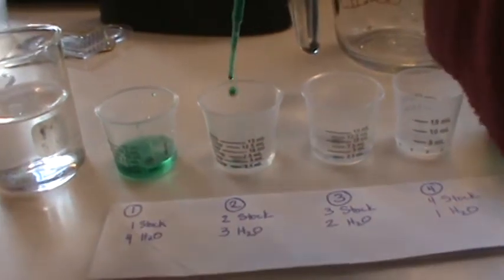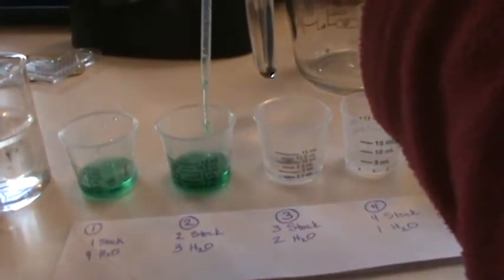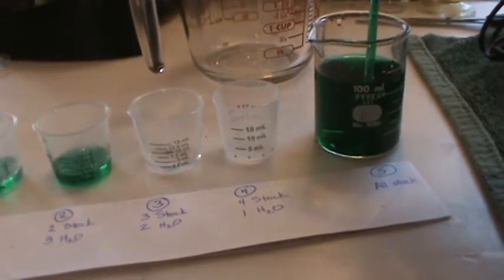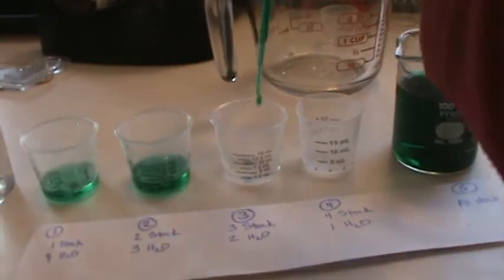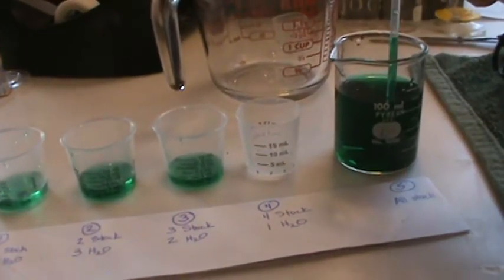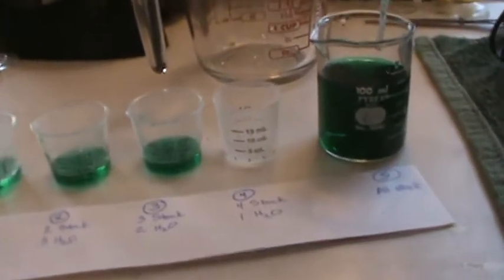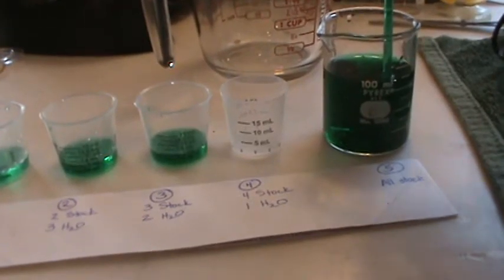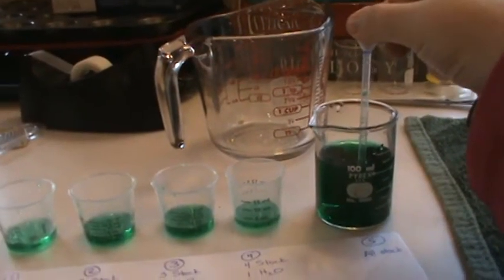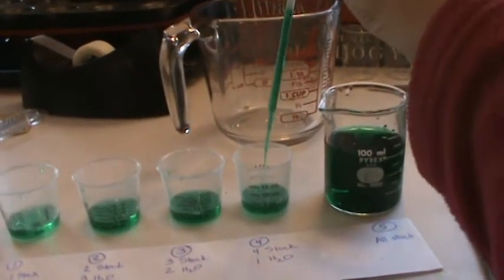will have 2, 1, 2, and then solution number 3 has 3 in it. 1, 2, 3, and then we need to put 4 milliliters into our last one. 1, 2, 3, and 4.